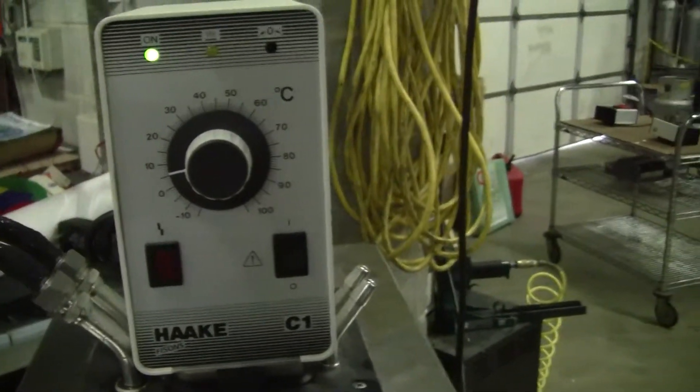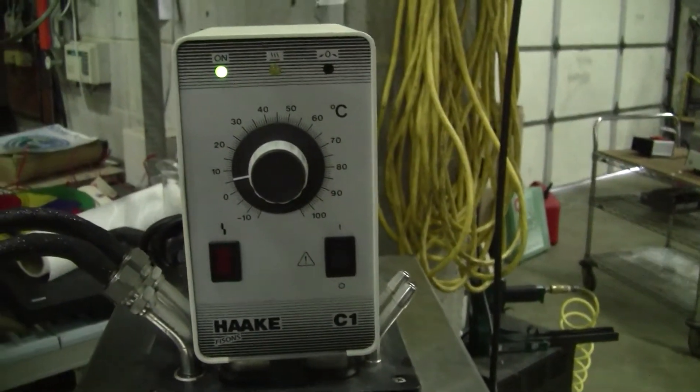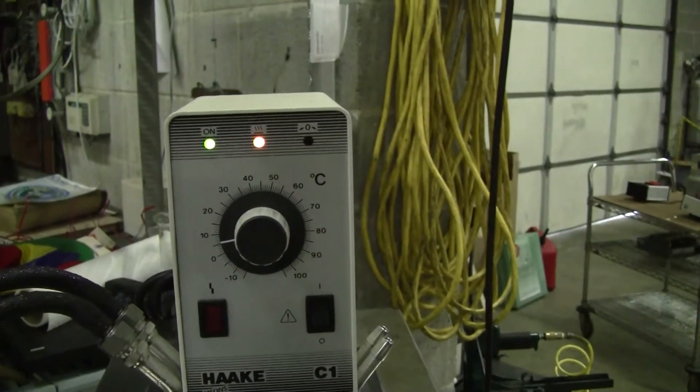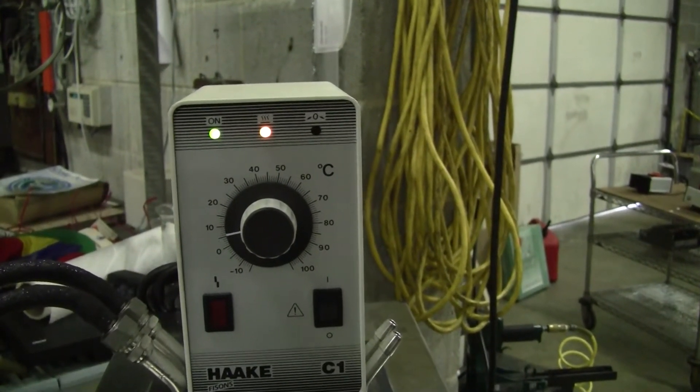Temp range on this, I'm going to accurately say minus 10, minus 15 if you really crank it down to 100 degrees C. As you can see there's the heating controller.